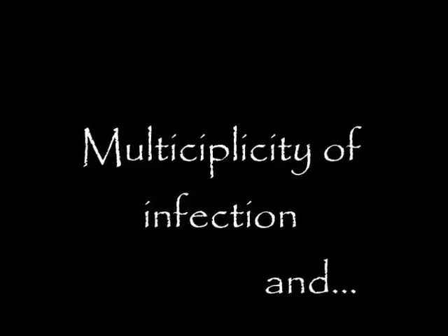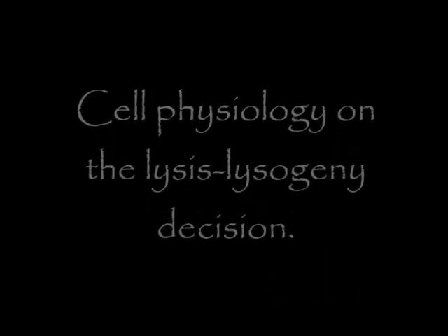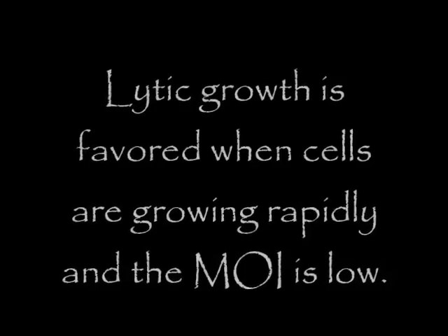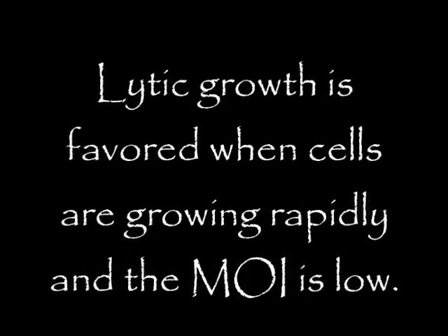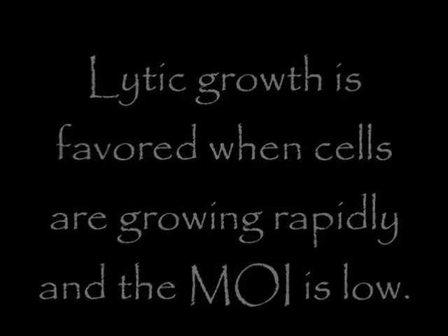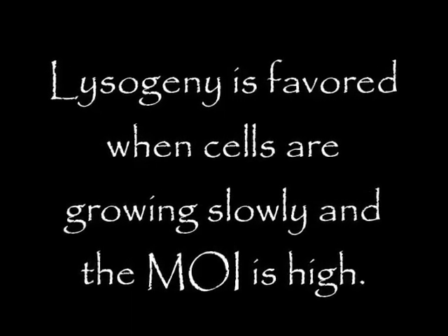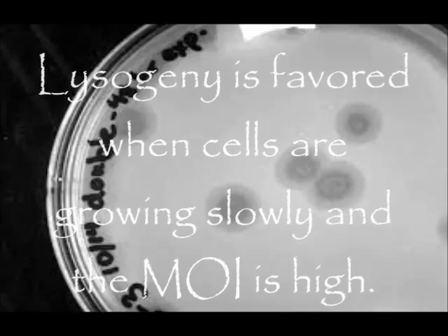This characteristic plaque morphology is due to the role of the MOI, or multiplicity of infection, and cell physiology in the lysis-lysogeny decision. Lytic growth is favored when cells are growing rapidly and the MOI is low. Lysogeny is favored when cells are growing slowly and the MOI is high. This is why temperate phage typically have plaques with turbid centers.